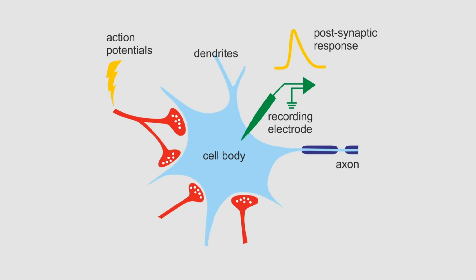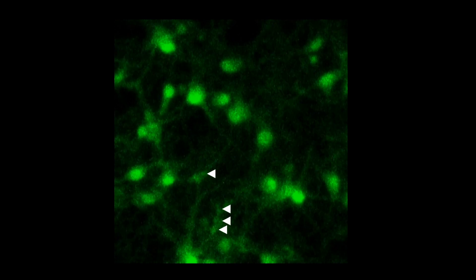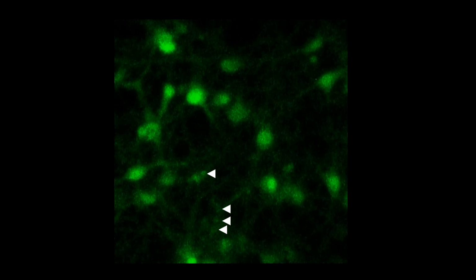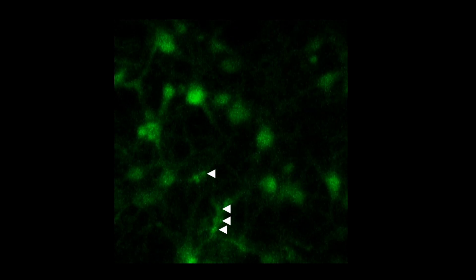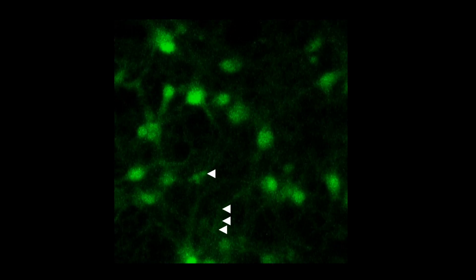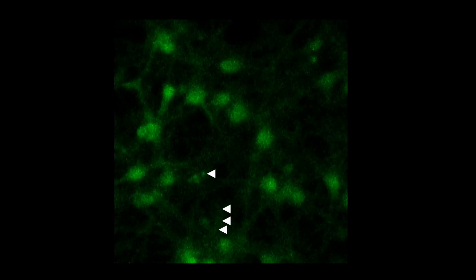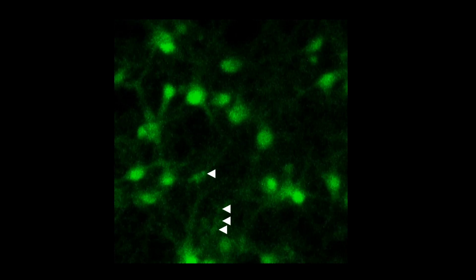In the early 1990s, fluorescent dyes were developed that glow brighter when they bind calcium, which allowed neuroscientists to study for the first time the calcium signals in synapses. In this movie, some neurons in a petri dish were incubated with a fluorescent calcium-binding dye, shown in green. The large bright blobs are the neuronal cell bodies, where the calcium concentration is often higher. The synapses are situated along the processes.